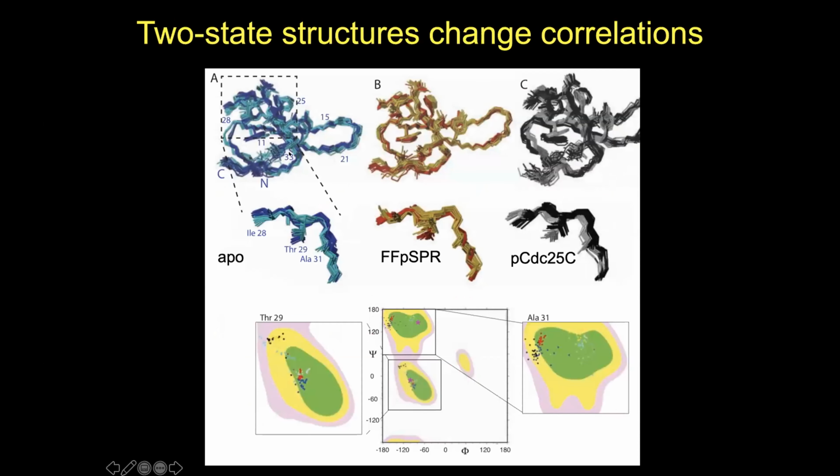Here are the structures we calculated. So we just picked 2-state structures. Here in blue is the apoform. I superimpose about 10 2-state structures. Each structure then has a cyan and a blue state. And because every structure calculation produces the same 2 states, we can conclude that these states are not random, but they are in this data. Then we have something similar for the 2 bound states. Here we observe 2 structures, 2 states.